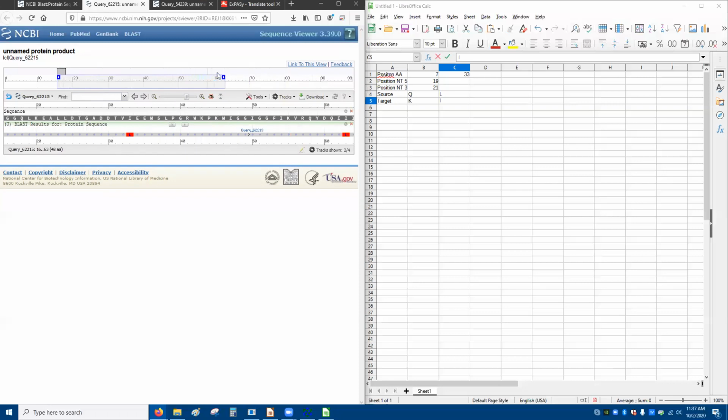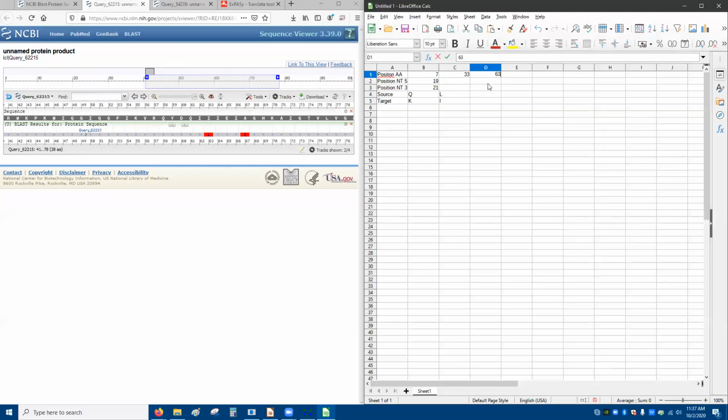There we go. Okay, so we got 33, got 63, 67. This is L, I, C, A.